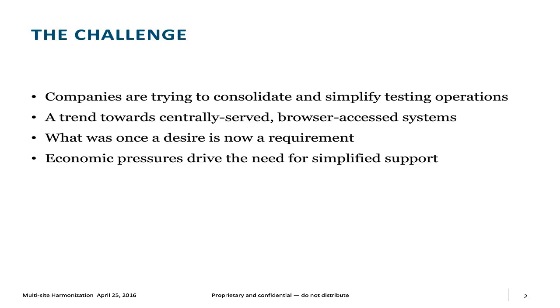And from a training aspect, you're not training people on 5 different systems or systems indigenous to specific sites. So you could train on one system, and we do realize that there are differences sometimes that are required between geographical sites. This is something we'll address in a few minutes. But overall, it was the customer base that started to put pressure on the suppliers of LIMS systems to get to a centrally served system.